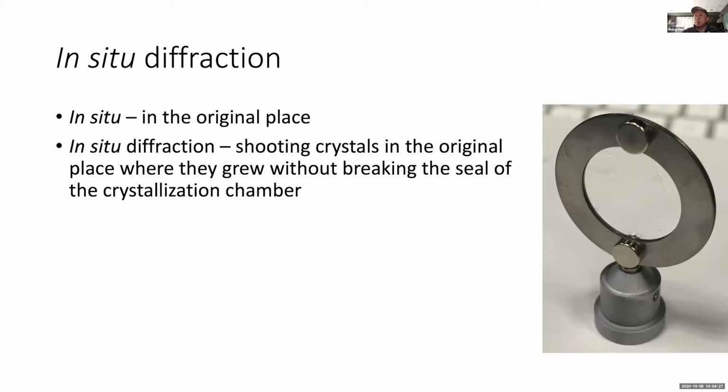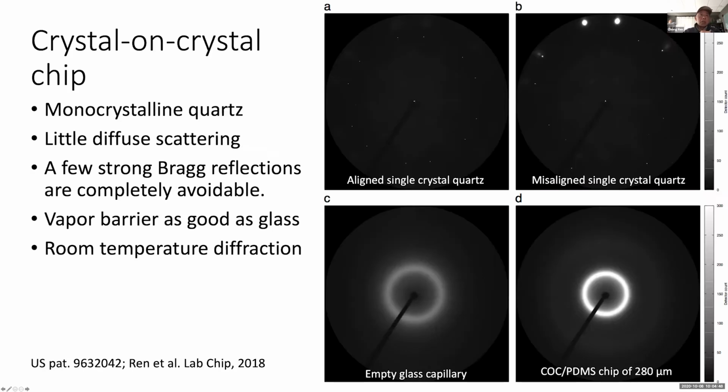But basically, there is a circular window in the middle. The crystal is actually scattered all around this window. And X-ray will penetrate this window directly and shoot at the crystal. And the key point is this window itself is another crystal. We chose to use monocrystalline quartz. Monocrystalline means it is literally another piece of a single crystal.